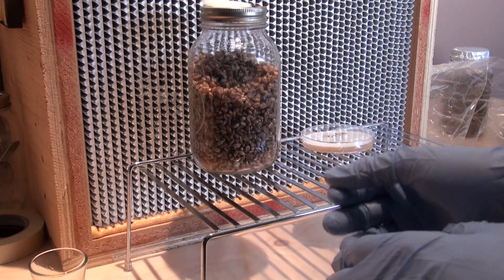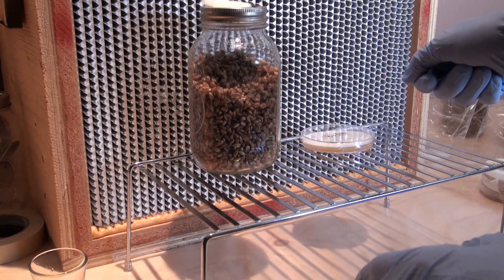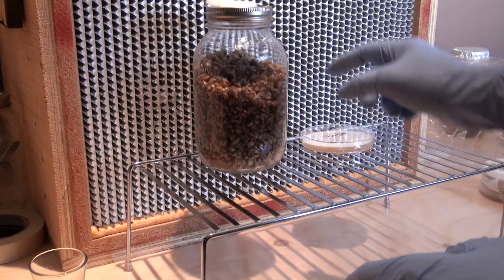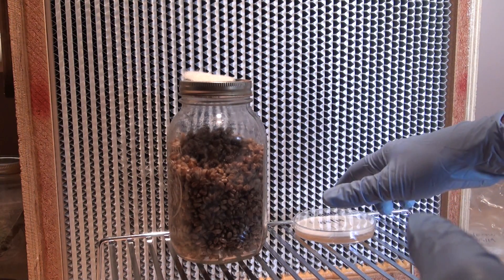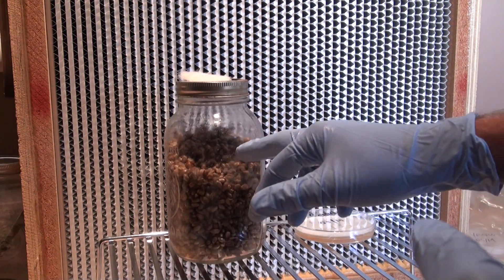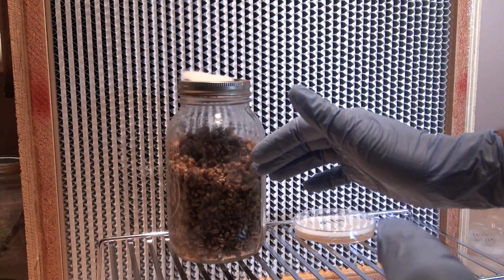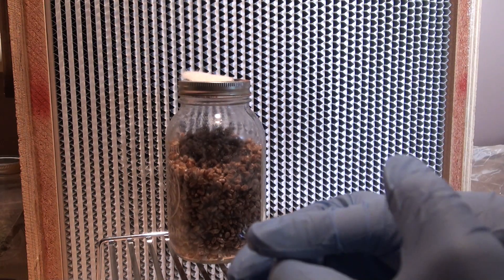The process basically involves taking your scalpel and flame sterilizing it. Then you're going to cut out a couple of wedges of reishi — or whatever culture you happen to have — and place them inside the jar. The reason we put a couple of wedges in instead of just one is so that when it's in the jar it'll have multiple inoculation points, allowing it to colonize the jar a lot faster, and again reduces your chances of contamination.